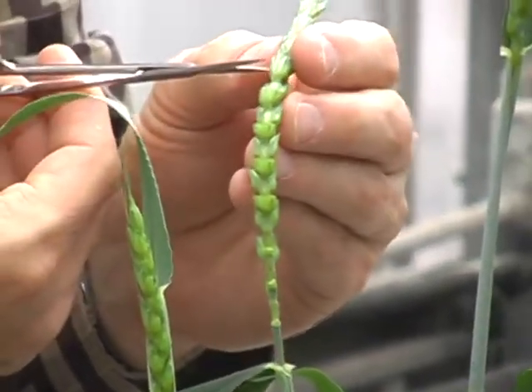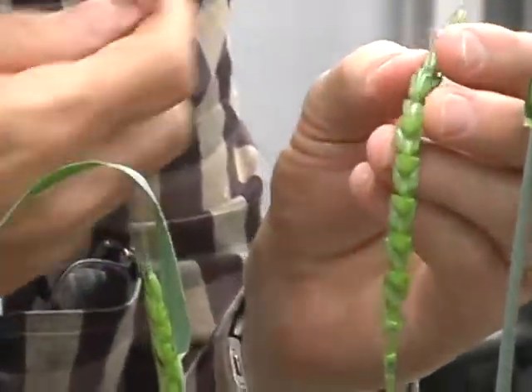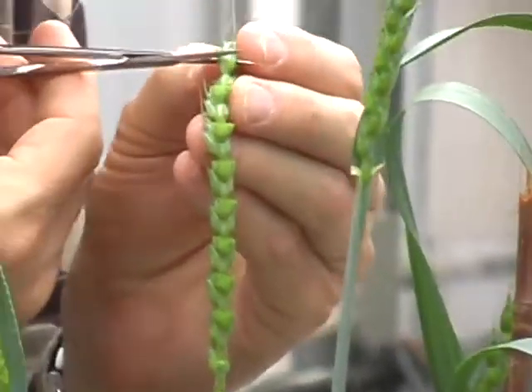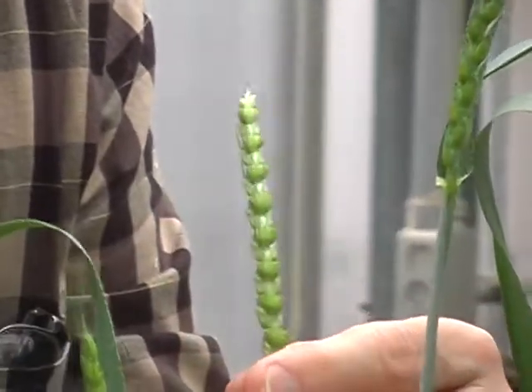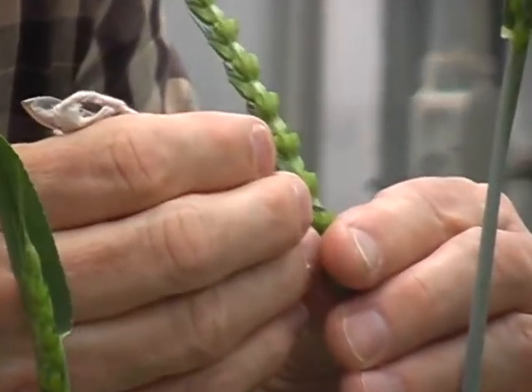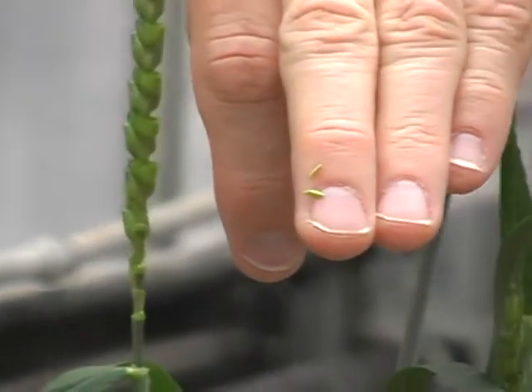Normally we pollinate two days after we emasculate. This is close work, so I usually take my glasses off when I do this. Our goal is to cut directly above the anthers so they're easy to get. Each floret has three anthers, so I always try to come in and get all three. There are the three anthers.